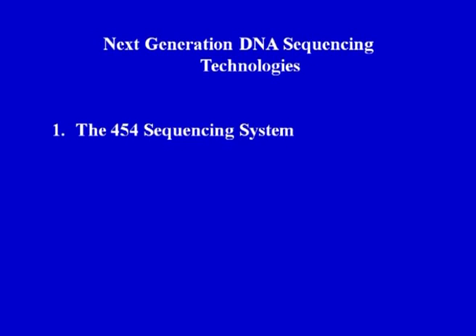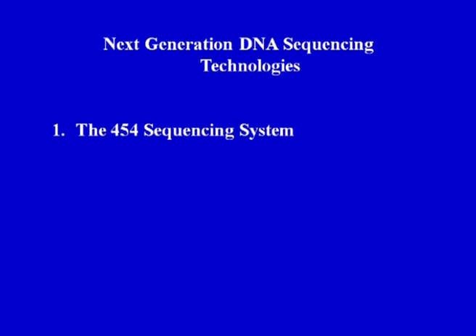Now, these methods, like map based or shotgun approach, were advanced DNA sequencing methods, but now next generation methods of DNA sequencing have come in, second generation you can say, and third generation methods have also come in. We will discuss some of them here. One is the 454 sequencing system. The Watson genome was sequenced using a system developed by 454 Life Sciences that employs the following methodology.